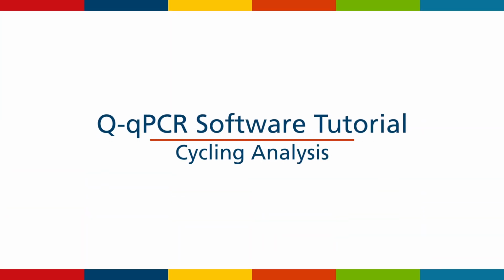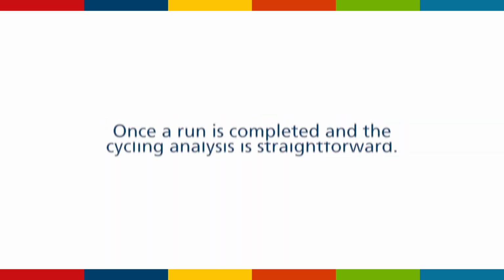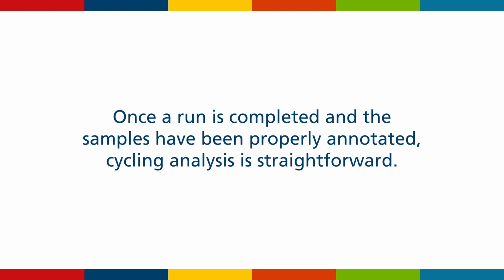Q-qPCR software tutorial. Cycling analysis. In this video, we will show you how to complete cycling analysis for any run using the Q-qPCR software. Once a run is completed and the samples have been properly annotated, cycling analysis is straightforward.